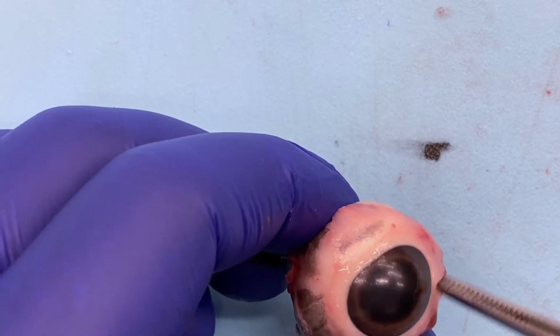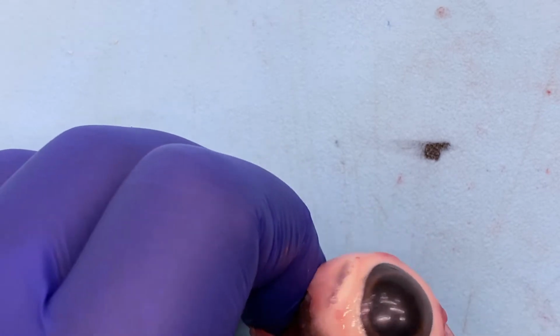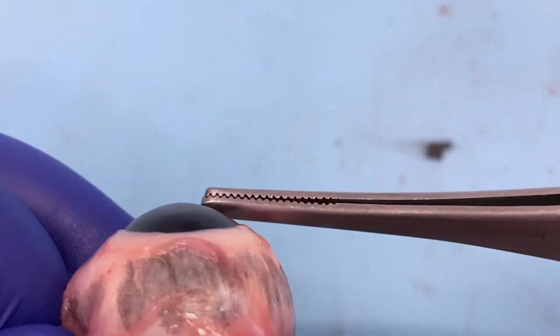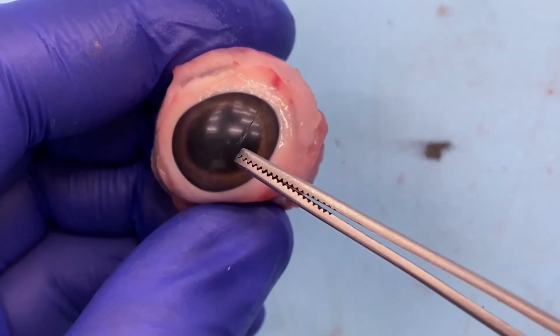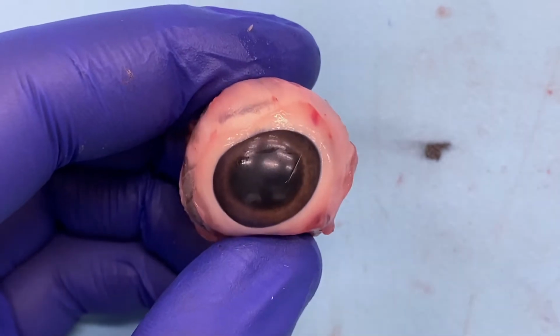We see the surrounding margin of our cornea, which is the limbus, and that sort of marks where our cornea is going to start. Let's see if you can see here. You can see the cornea is going to rise up, that translucent section of sclera going anteriorly. You'll see the darkened portion in the center there is our pupil, and surrounded by the iris, which makes up the colored part of our eye.